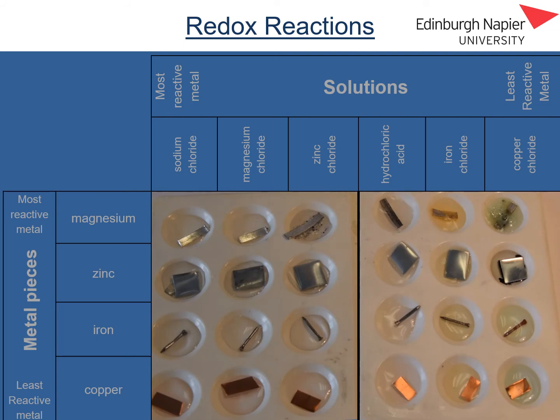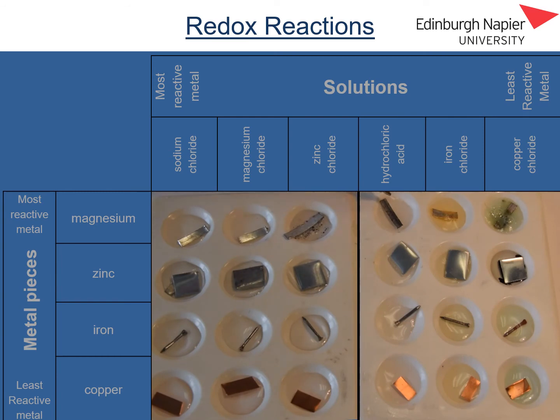Looking at the results, magnesium hasn't reacted with the sodium chloride solution or with the magnesium chloride solution. However, there is evidence of magnesium having reacted with the zinc chloride solution, with the hydrochloric acid solution where there were bubbles of gas being released, and also with the iron chloride solution and the copper chloride solution.